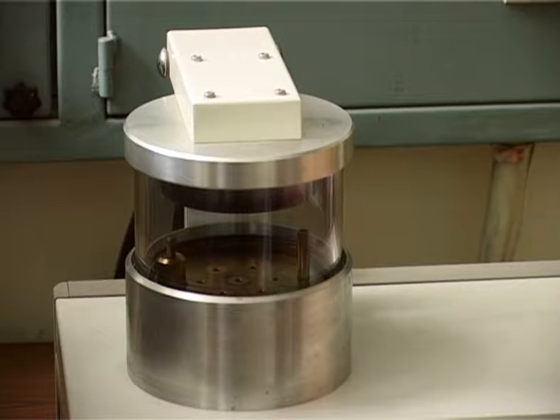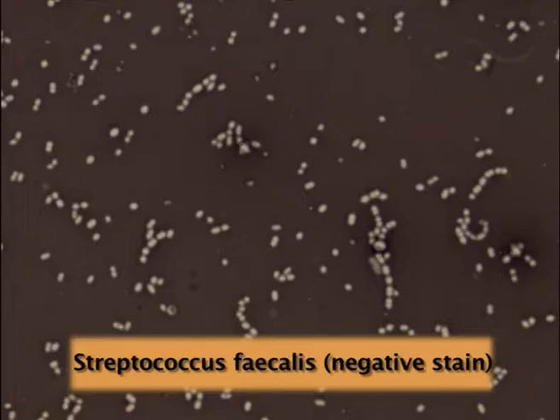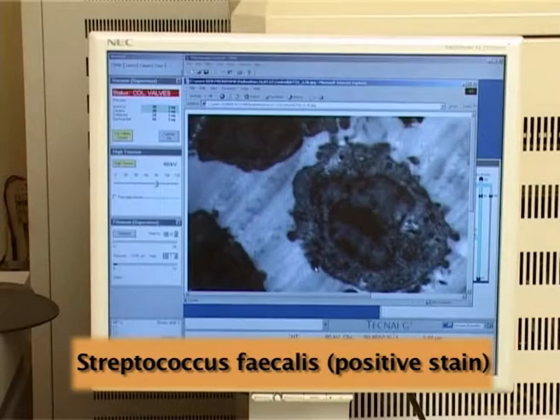In the case of some biological specimens, other types of sample preparation can also be done. One of the examples is negative or positive staining. In the case of positive staining, lead acetate or uranyl acetate can be used to stain the sample per se. However, in negative staining, we actually stain the background and not the sample. So, contrast is enhanced for some objects.